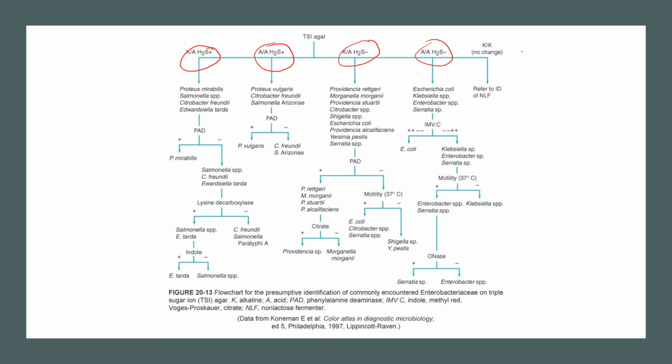To do that, let's go back to the MacConkey reaction. If the organism is a lactose fermenter on MacConkey, then the TSI will be acid over acid, whether H2S positive or negative. And if MacConkey shows negative lactose fermentation, then you should expect an alkaline over acid reaction on TSI, whether H2S positive or negative.